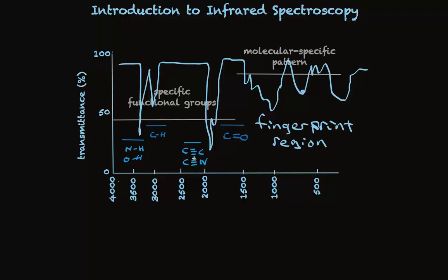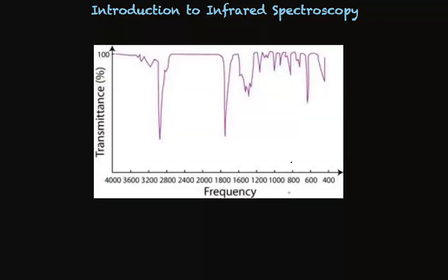Now, finally, I thought you might want to see a specific actual spectrum. So I have one here, taken from a database that's kept in Japan, the SDBS database that is extremely useful, widely used by many. Very easy to find on the web. And take a look at this spectrum as illustrating what I was just talking about.